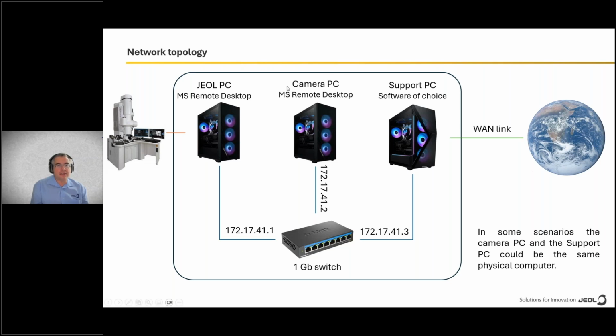The bottom line is that we want to connect to the internet either the camera PC or the support PC. The support PC can be very small. It can be just a laptop with 2 network cards.